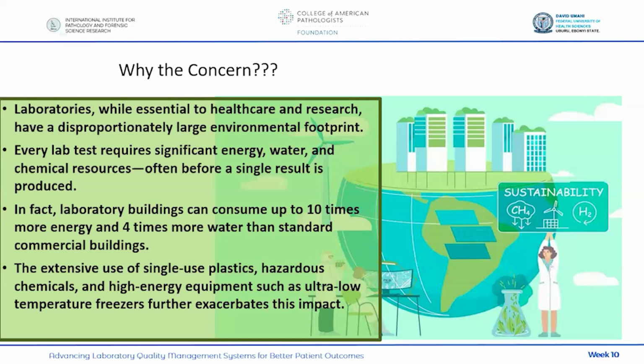And that is why in every lab, all lab workers, when power is down, everybody's shouting. When there's no water, nobody's happy. When reagents are out, nobody's happy, because you depend heavily on these things. You depend heavily on energy, on water, on chemical resources before you can generate a single lab result.